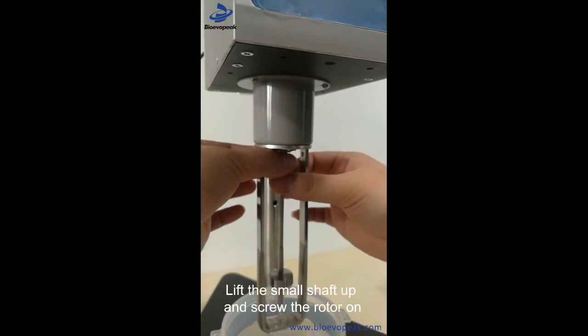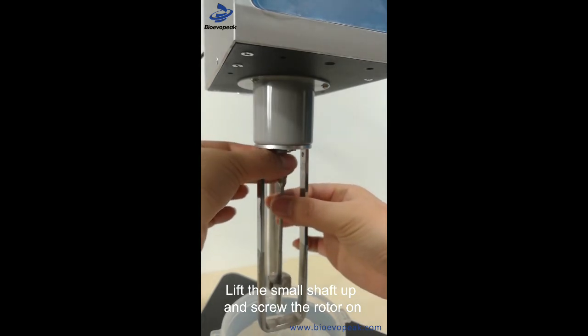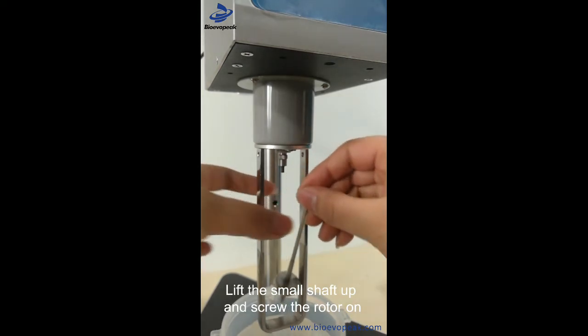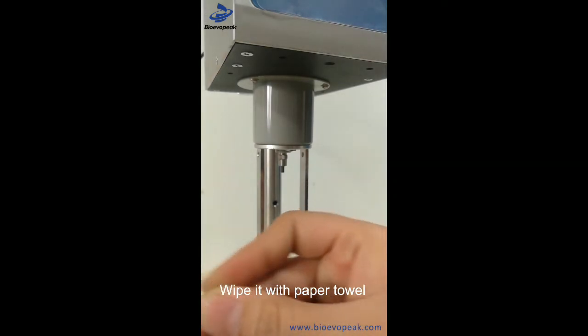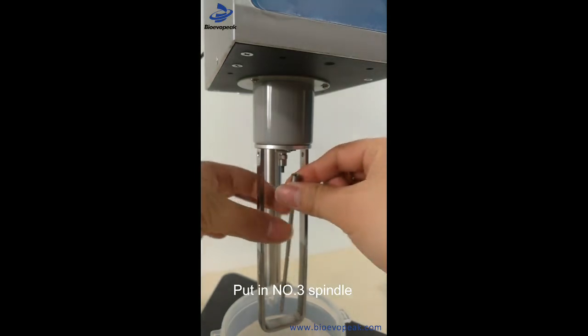Remove rotor 2 and wipe it clean with a tissue. Then insert rotor 3.